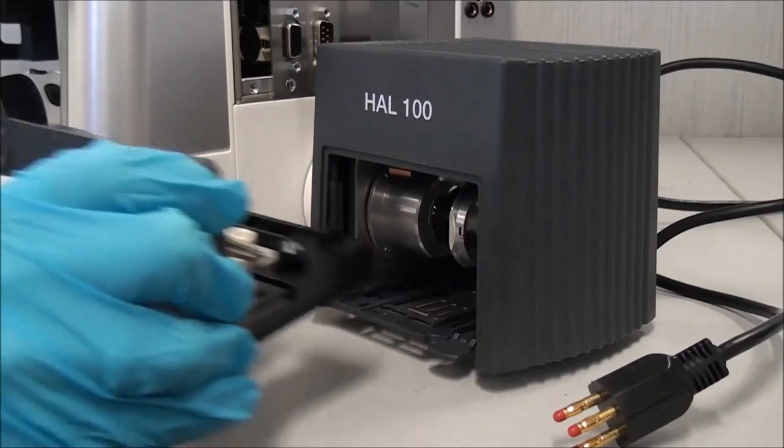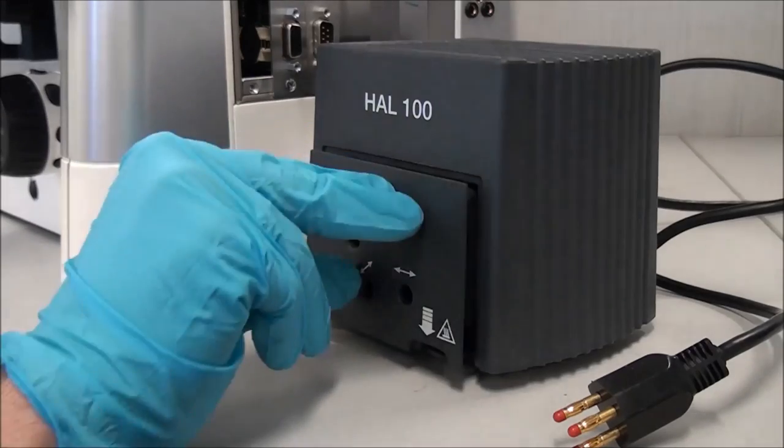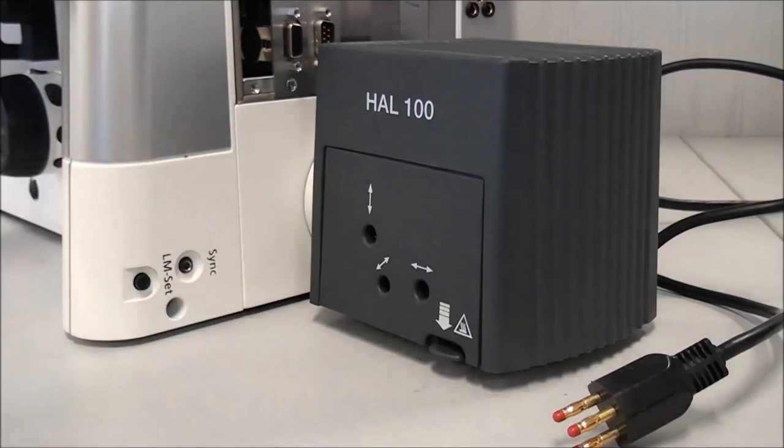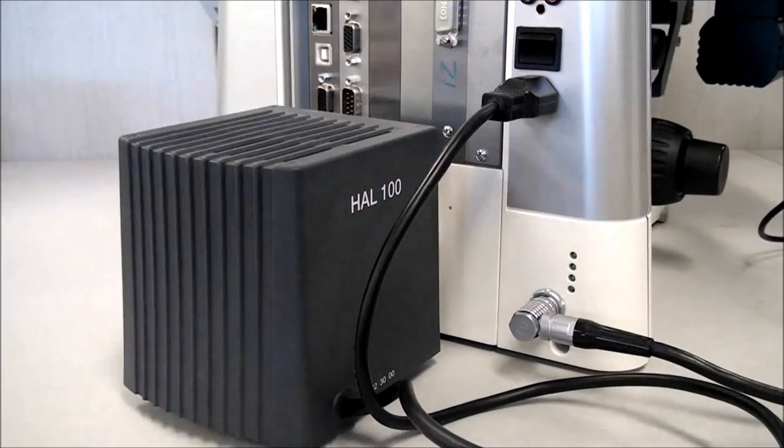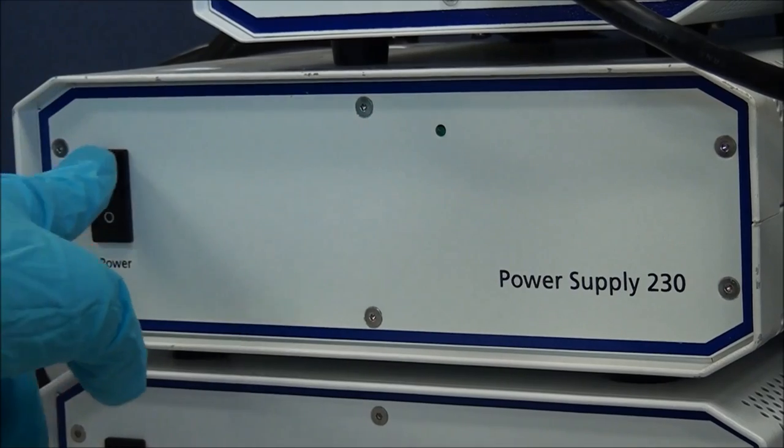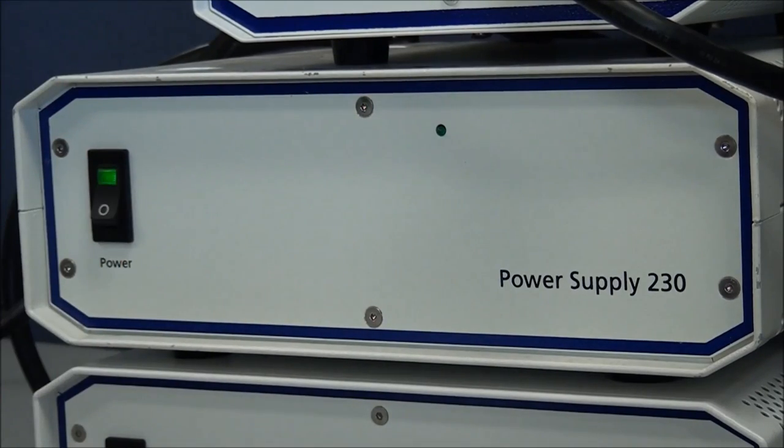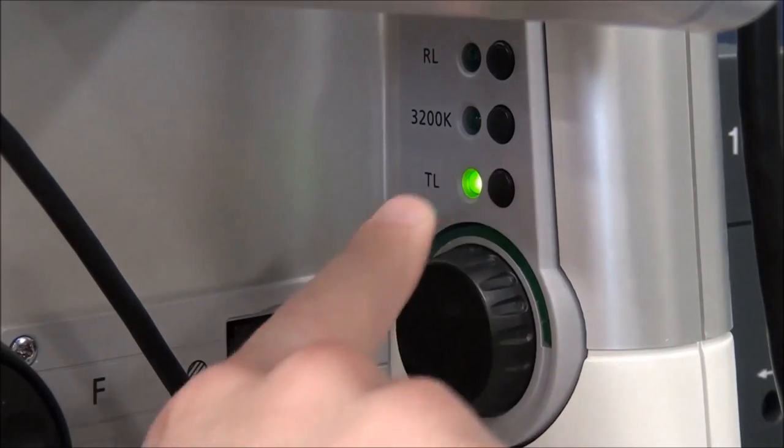Slide the lamp tray back into the lamp housing until it audibly clicks into place. Fully reconnect the three-prong plug for the halogen lamp into its former location. Turn the microscope back on and turn the lamp intensity up.